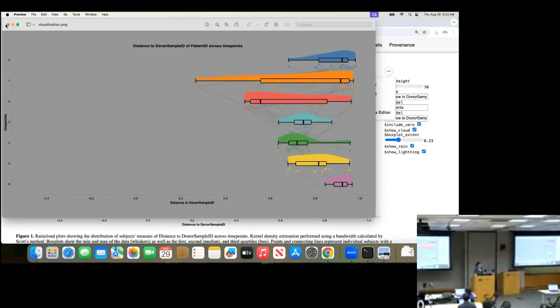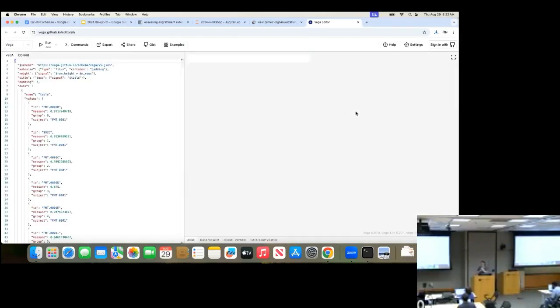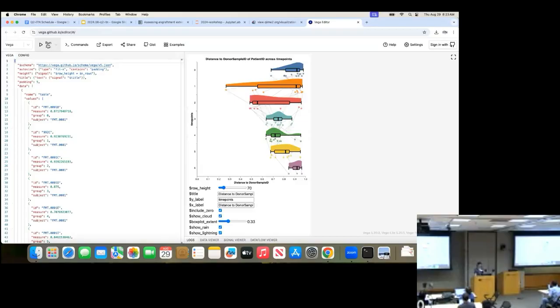Okay, so this is probably an overwhelming look into code, just to give you guys a little heads up. But this is all done in Vega, which allows us to have amazing, amazing interactive visualizations. And so here is a huge Vega spec that allows this all to be rendered. And it's not running, so let me just run it real quick. It's actually the code running behind the scenes the entire time and creates our visualization for us.